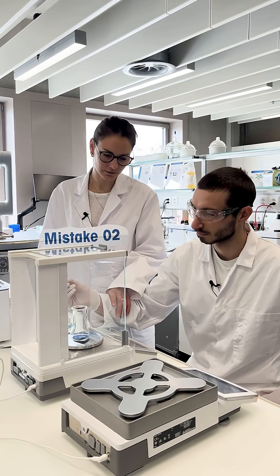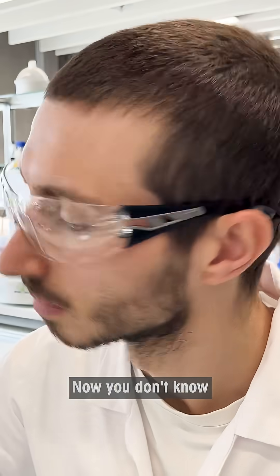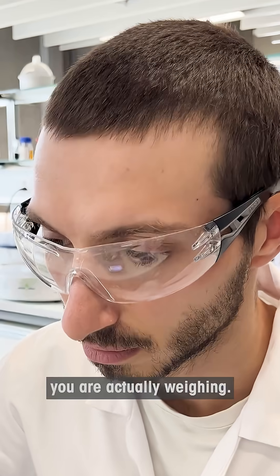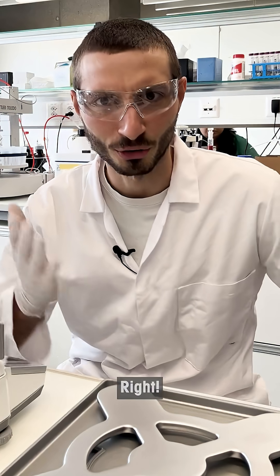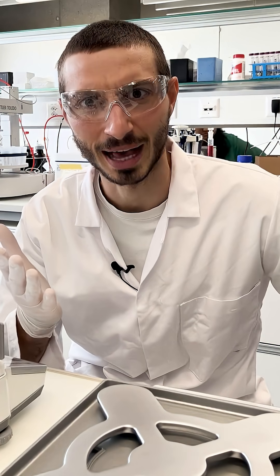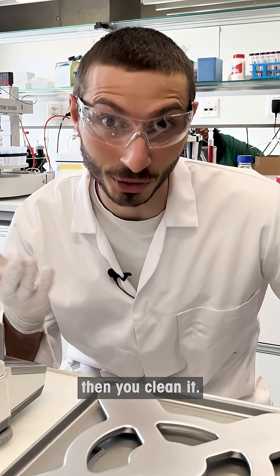Mistake number two. Look, you just spilled. Now you don't know how much you are actually weighing. No spillage — and if it does happen, then you clean it.